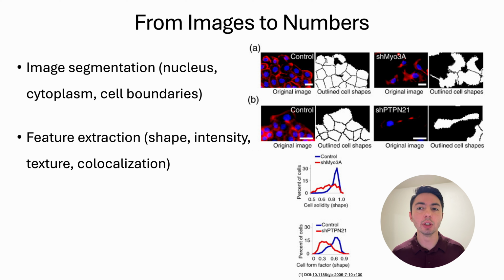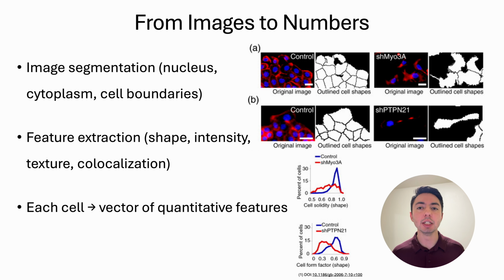There are different ways to do this, though. For example, taking the mean of all cells, summing values, or aggregating them in more complex ways. And these choices can affect the results. There's also nuance in terms of what's being aggregated, since some measurements originate at the pixel level and others at the cell level. Which one you choose will depend on exactly the biology behind what you're studying.